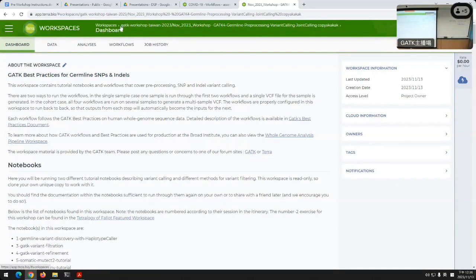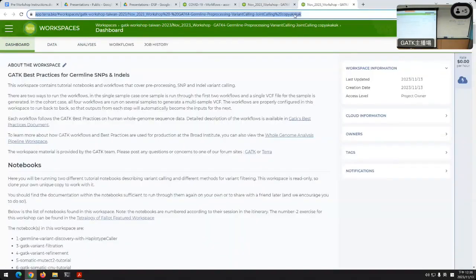First of all, you can see up here, now it says the billing project that I just used to make this clone, and it has my unique clone name up here. By the way, this is a clickable link right here. So like, if I click on that, it goes to this workspace, and this is a link that you can just share with other people. If I were to share this exact link with any one of you, you would get an error message because you don't have access to this.